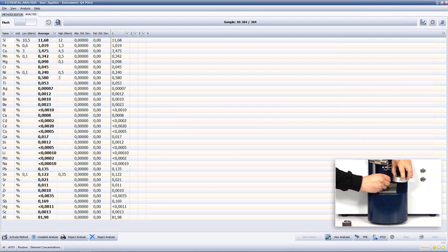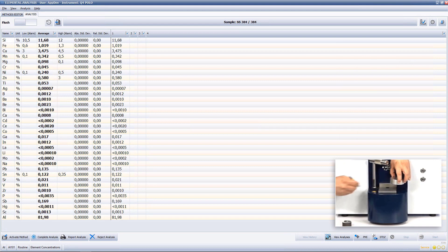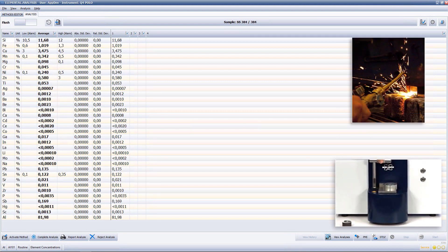4000 series is an aluminum silicon alloy that is commonly used as filler material.